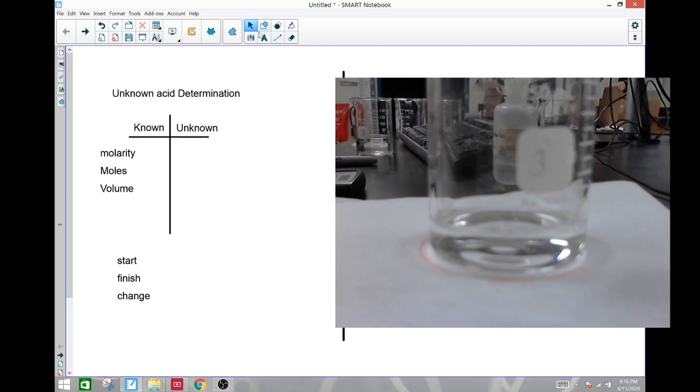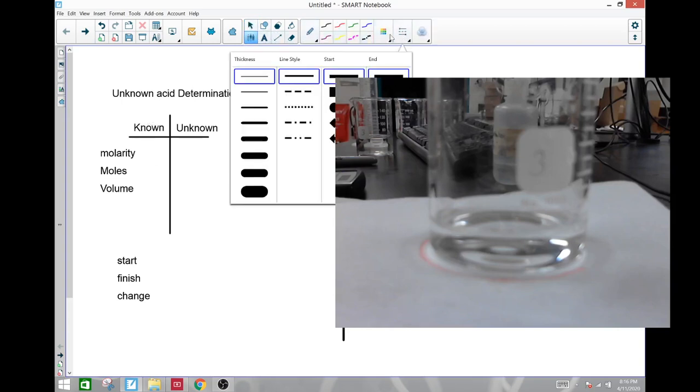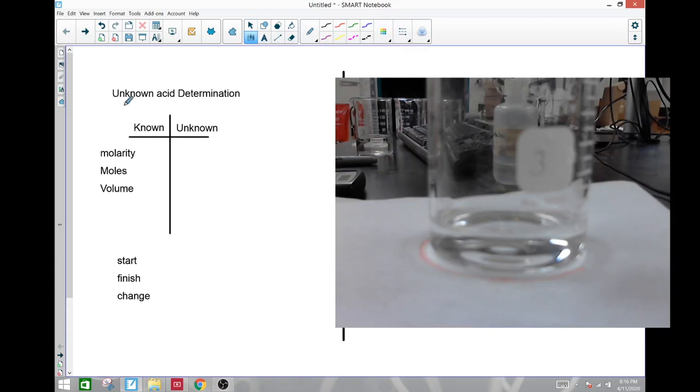The known is the base. It is NaOH, and it has a concentration of 0.1 moles per liter. And then the unknown is 19 milliliters. I have 19 milliliters of the unknown. That's pretty much all I'm going to really tell you about that. And the starting volume is 3.5 milliliters on my burette, so I will give this to you here. 3.5 milliliters is my starting volume on my burette.